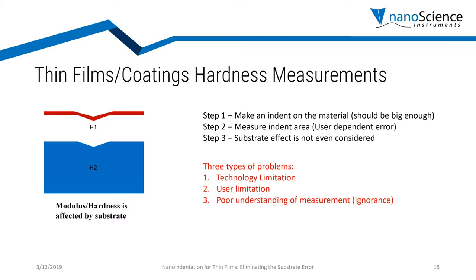The second error is user limitation. Because we are measuring the area of the indent, ten different users will measure these areas in ten different ways, leading to inconsistencies in your data that we want to avoid. The third part is a poor understanding of the measurement — not many people are aware of how much the substrate can influence the measurement of thin film properties. We want to be able to take care of that.